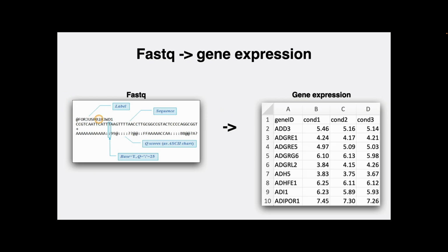In addition to the raw sequencing data itself, we also discussed how FASTQ files contain information encoded in these ASCII characters that tell us about the quality of each base that was sequenced. One of the things we'll do in this lecture is actually use one of the programs we installed in the last lecture, FastQC, to parse these FASTQ files, and in particular, the quality scores, so that we can understand the quality of the sequencing data before we move forward with any downstream analysis.